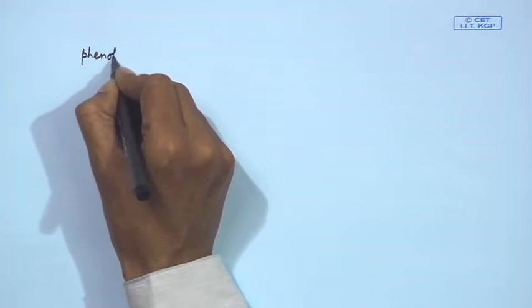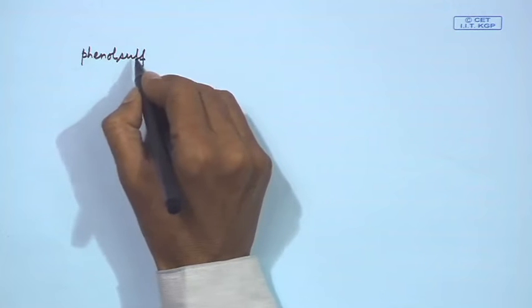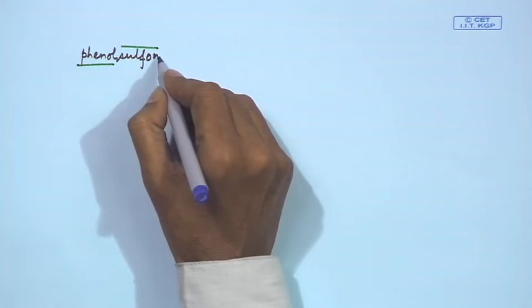For a particular example of a weak acid, we all know phenolphthalein and use it. But here we will talk about something very much related to it, whose name is phenol sulfone phthalein. So just remember the name very well, because the name will tell you something: phenol, sulfone, and phthalein.